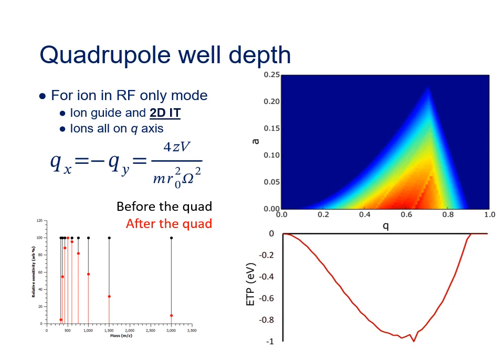In a linear ion trap, the probability of an ion produced outside the ion trap being trapped inside the ion trap is also a function of the trapping well depth. If the incoming ion beam includes ions with kinetic energies greater than the trapping well depth, then these will be lost instead of being trapped for analysis. For a given setup of linear ion trap, it will be most sensitive for ions that trap in the deepest part of the trapping well. And this means it will prove to be less sensitive for ions of much higher mass-to-charge ratios, as these will plot at lower values of Q and so experience a shallower trapping well.